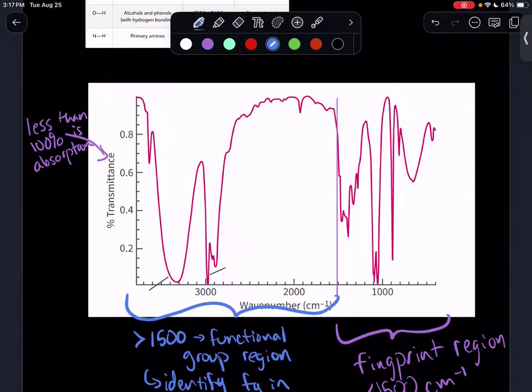Now, what I'm showing you right now is specifically a 2-carbon chain. I know what this is, but let's go ahead and see what functional group is present on our 2-carbon chain. And you'll notice I deleted some information. So we have this first region right here, this valley right below 3000, around 2900. So what is a sharp downwards peak?